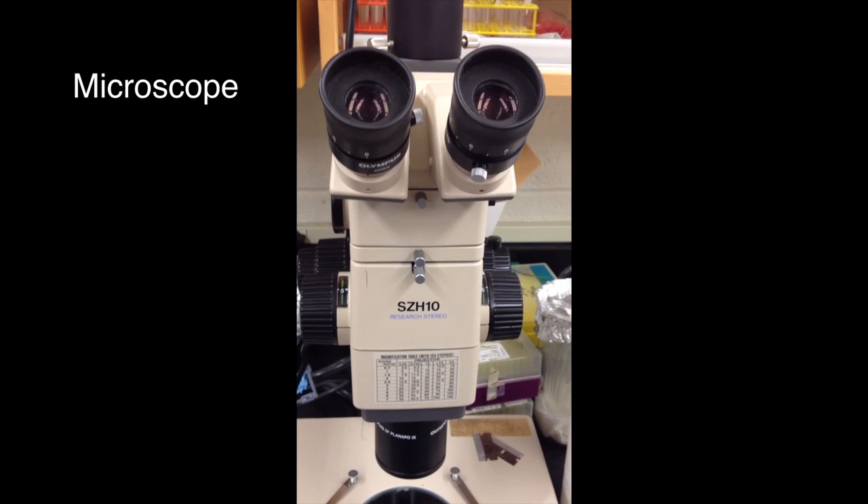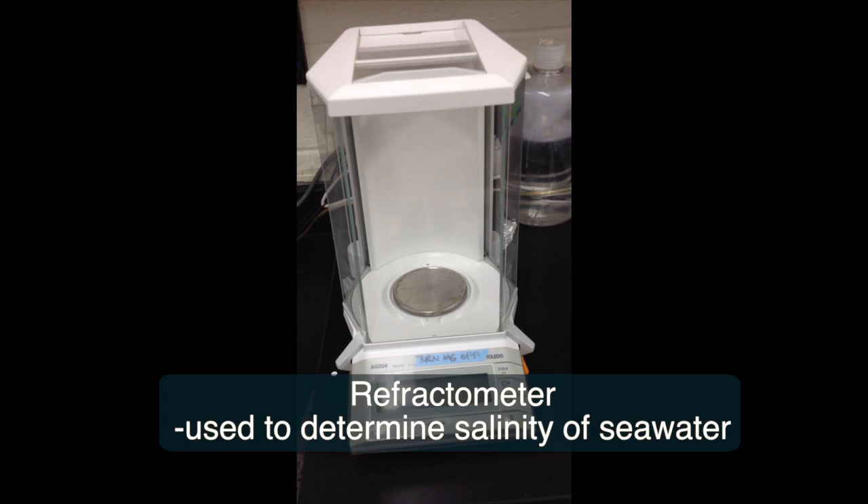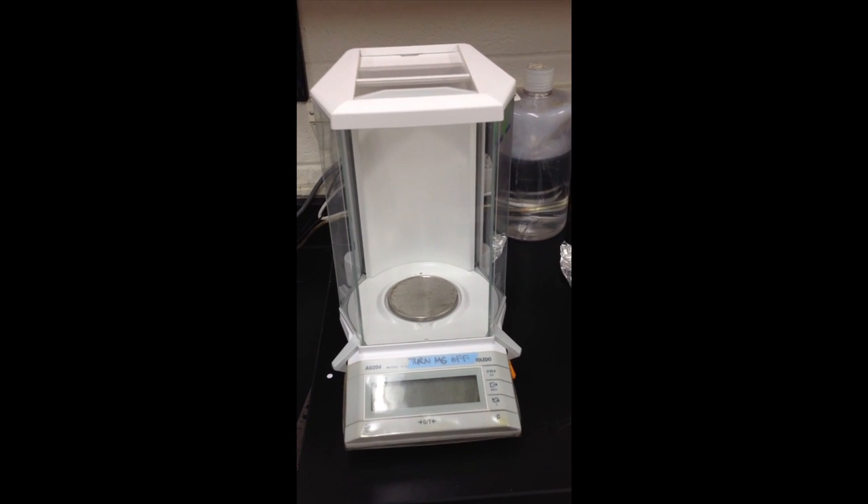Some basic equipment to have in a seaweed lab will include a compound microscope, a dissecting scope, a refractometer, a scale, a light meter, a thermometer, forceps, glassware, a lab book, pH meter, stir plate, Bunsen burner, and pipettes.